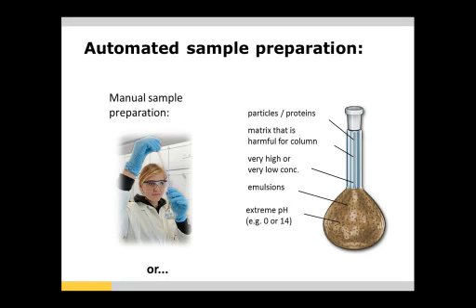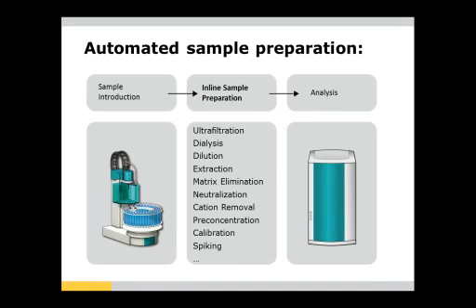For the associated sample preparation, we have two choices. We can go by the traditional manual sample preparation, which is tedious and time consuming, or we can automate the entire sample preparation by the inline sample preparation methodologies.